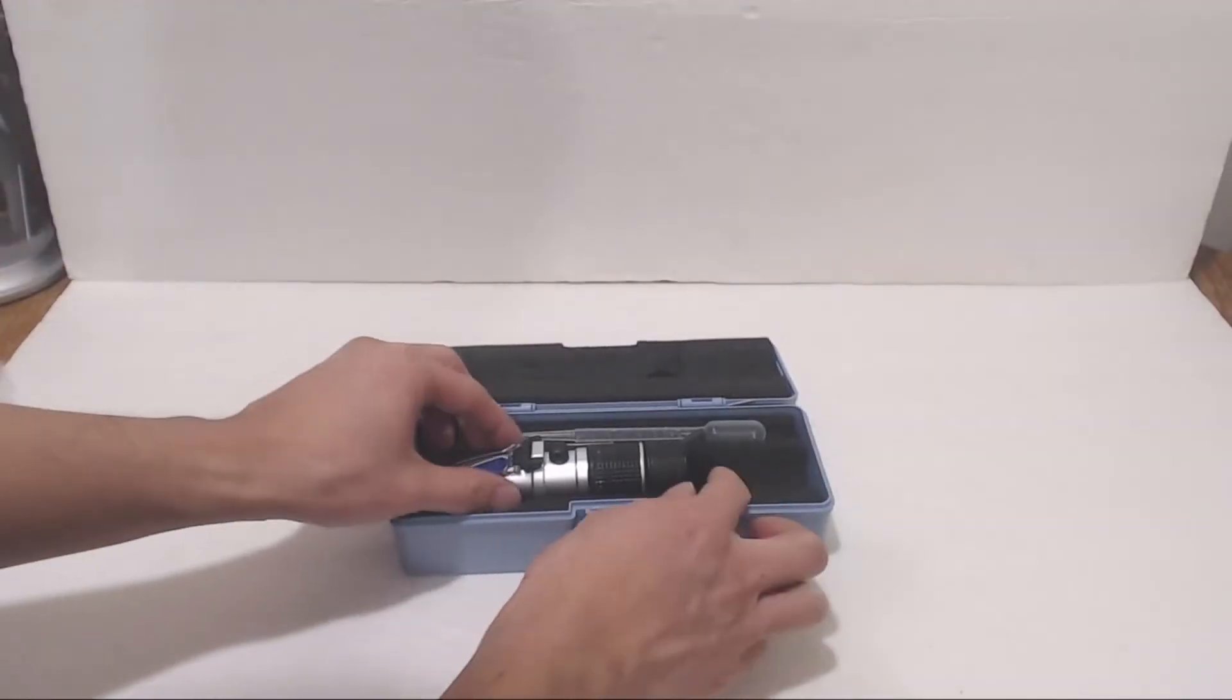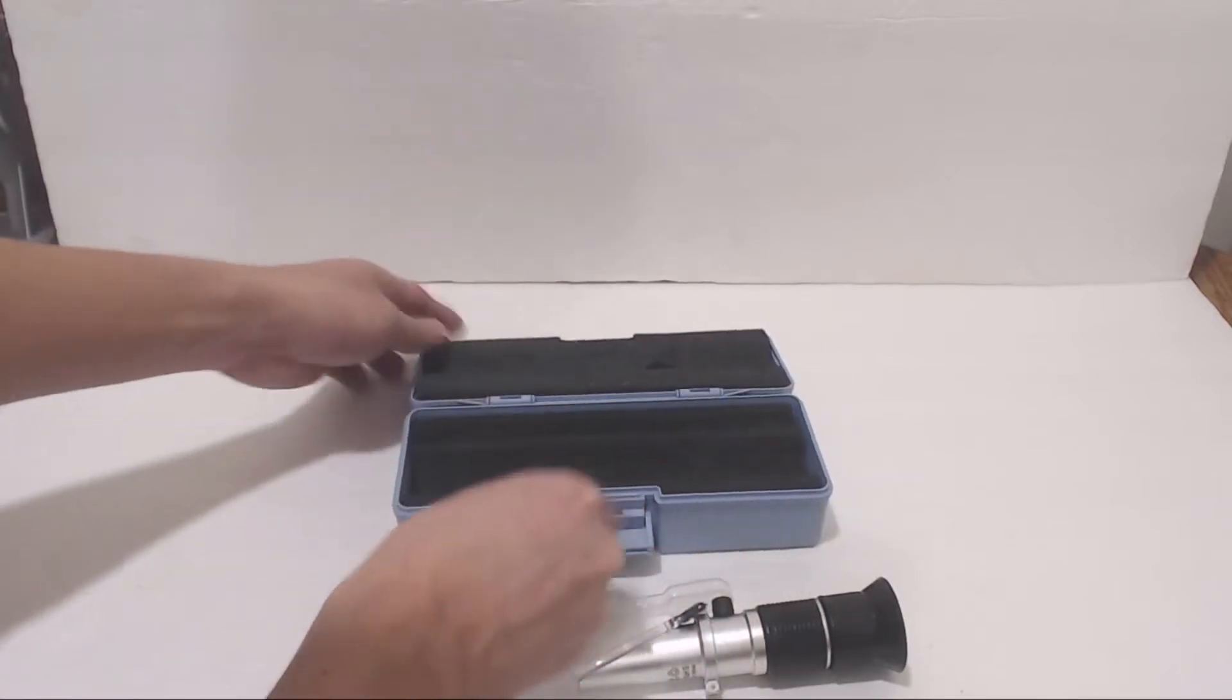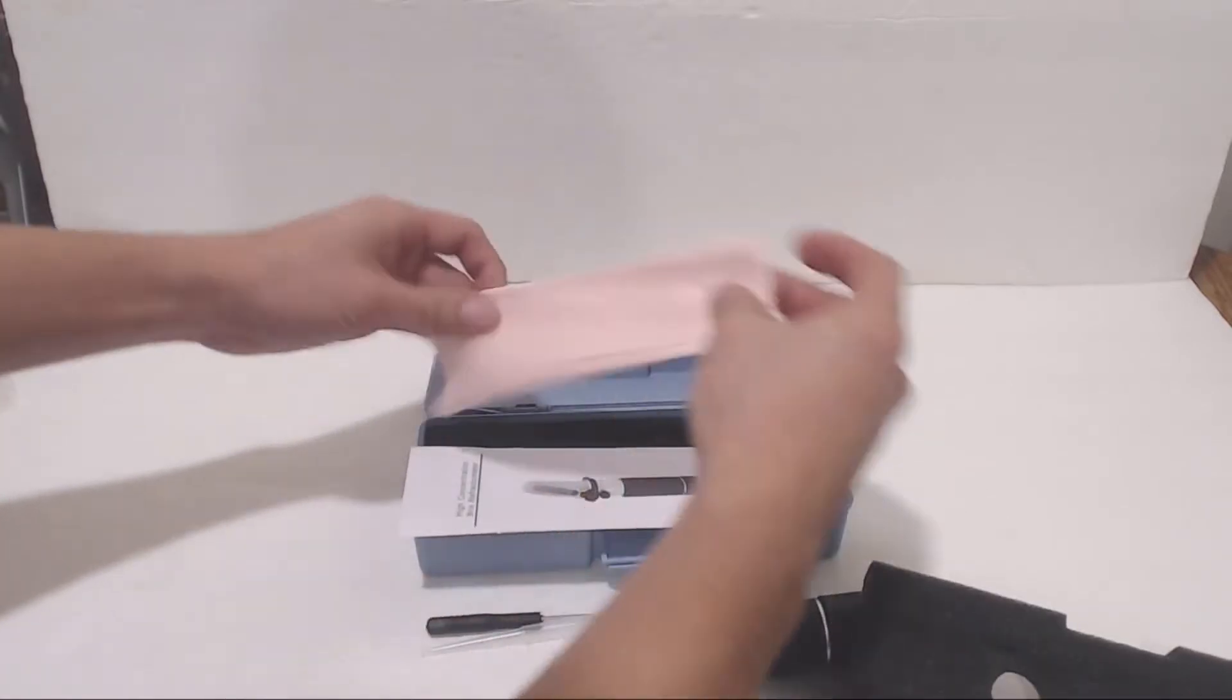You'll receive the refractometer in a hard plastic case, and it comes with a plastic pipette, a mini screwdriver, a set of instructions, and a cleaning cloth.